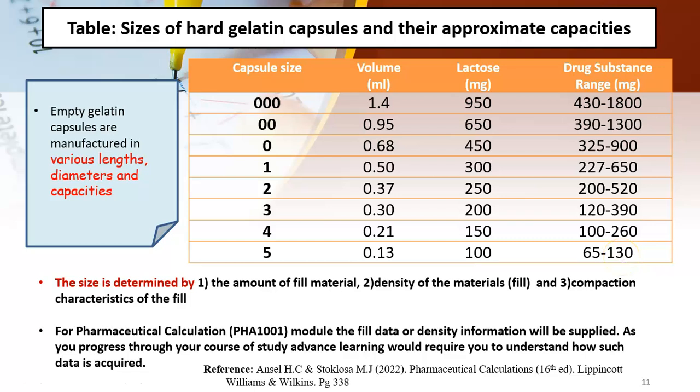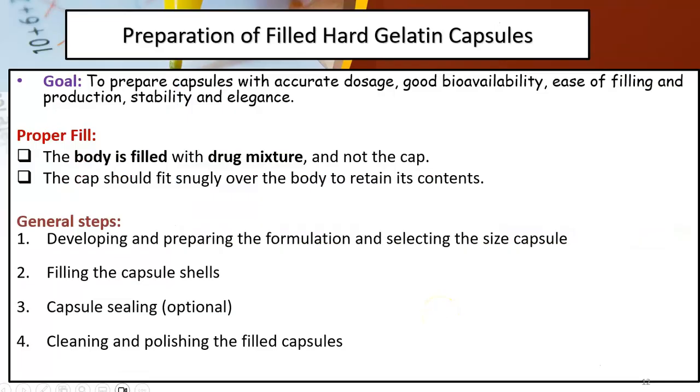That is why when you're doing a capsule calculation, the density of the unique powder or the fill capacity of that unique powder is important to fill the shell. You cannot use the fill capacity for powder B for powder A. No, it will not fit in the capsule the same way. So let's look at it. The goal is to elegantly fill our capsule. Nice, not to stuff it like a stuffed turkey, nor to underfill it so it looks empty.